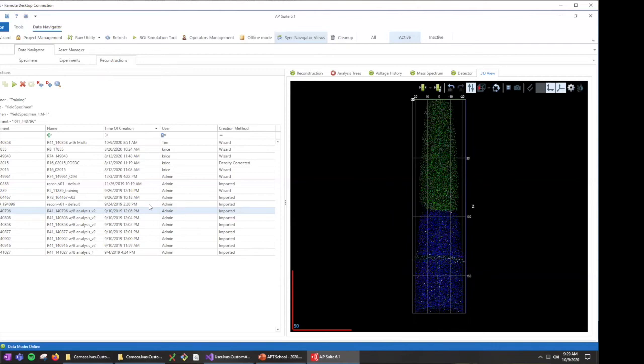And I guess that's maybe a point to make. The entire application we kind of consider a work in progress. So instead of waiting till, say, the custom analysis feature is totally done, totally fully documented, and releasing it, we're releasing it even though the documentation isn't perfect yet, so that we can be a little bit more agile in how we're releasing these features, and hopefully they'll evolve as the releases come out.